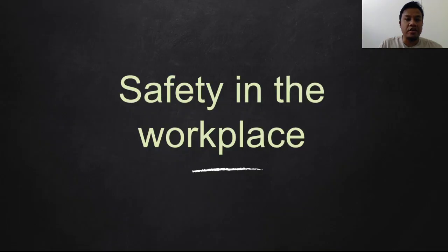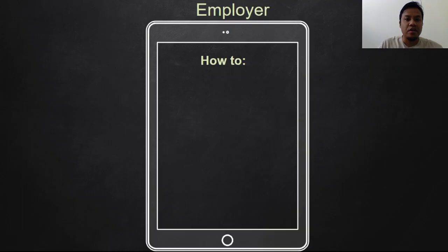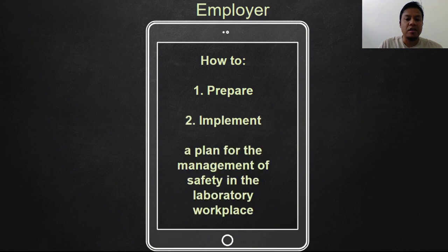For this lecture, I'm going to talk about a very important topic, safety in the workplace. Again, as usual, imagine yourself as a lab manager and you need to make sure the safety of your staff in the workplace. So how to first prepare, second implement a plan for the management of safety in the laboratory workplace.